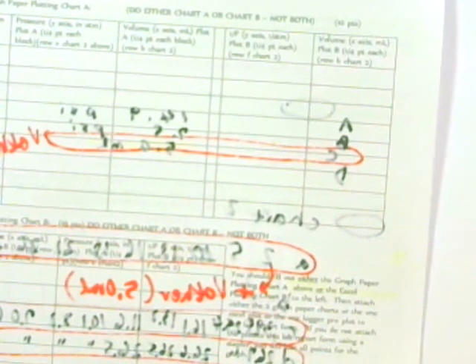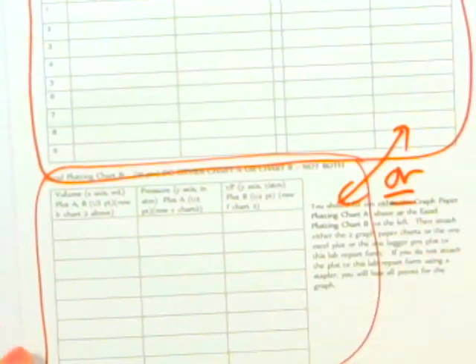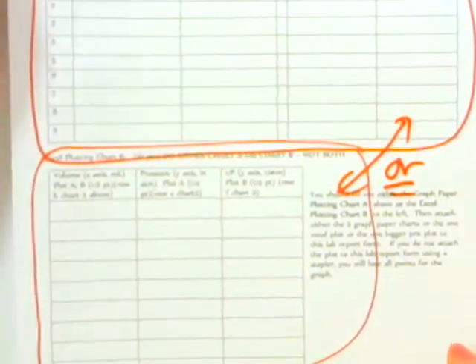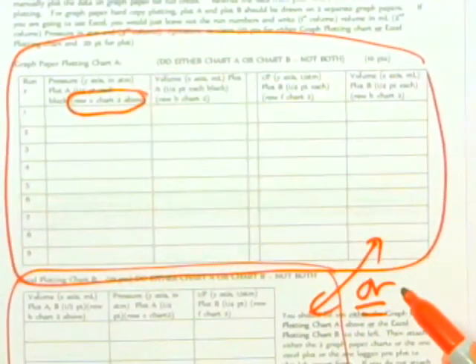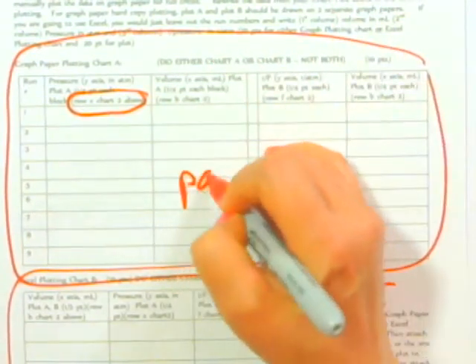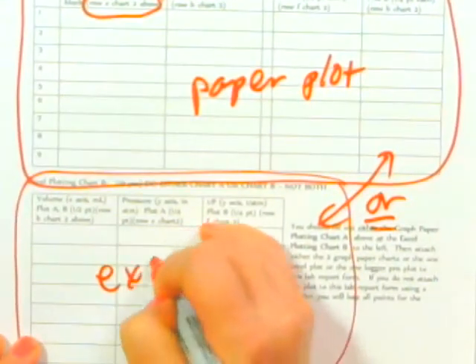And what you notice is that on page 2 of your LabPart form, this is page 2 of the LabPart form, it has a section that says I want you to do either this chart, or I want you to do this. So it's either this or that. It's not both. It tells you what you need to put into each part of the chart. This is the chart that you're going to use to do your graphing. This is what you do if you're going to do a paper plot. This is what you do if you're going to do an Excel spreadsheet plot.